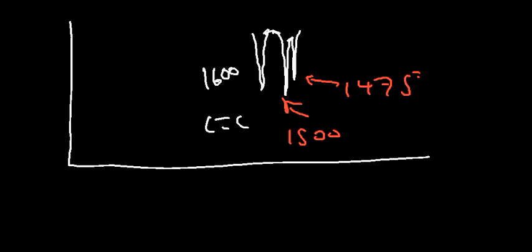So now what we're going to do is go over some multiple choice examples in which you can figure out what is the correct molecule if you're given an IR spectrum.